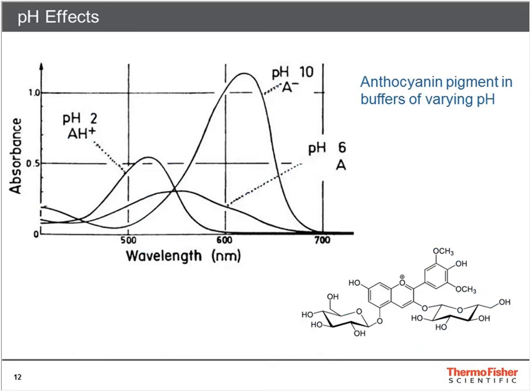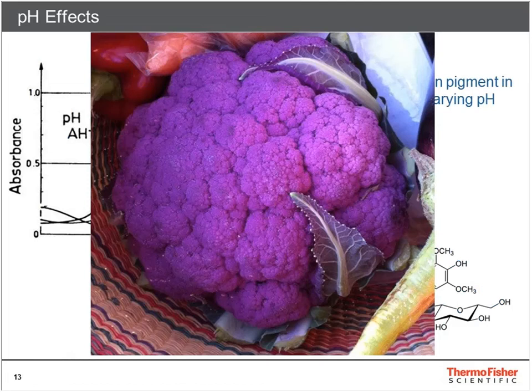A change in pH usually changes retention times. It might also affect absorbers. This can be very large if you are unlucky and the equilibrium shifts between two different forms. In this diagram, you can see really big differences when the pH is changed. The same sample is run at pH 2, 6, and 10. If you decide to use a buffer to control this, remember that they can also absorb the light. The example is a bit extreme. It is anthocyanin, which changes between red, purple, or blue depending on pH. You can find it in food plants such as blueberry, raspberry, black rice, and black soybean.